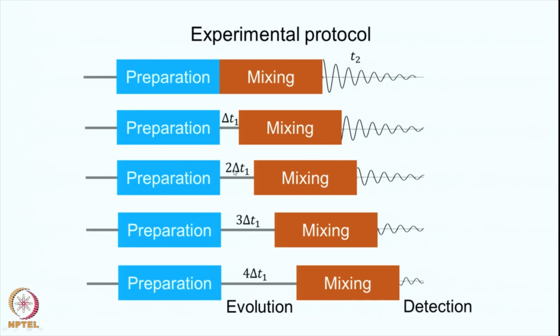Now, you increase this time to 2 delta T1. Here it is an increment, let us say about 100 microseconds. We will see what determines this time increment, and you systematically increment it. So, here you have delta T1, and you do this experiment once more with 2 delta T1. This part remains the same, these do not change. Only this changes, you increment this time. So, it is 2 delta T1 and you collect an FID once more here.